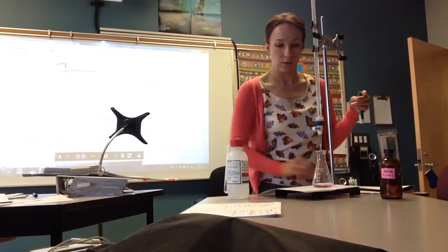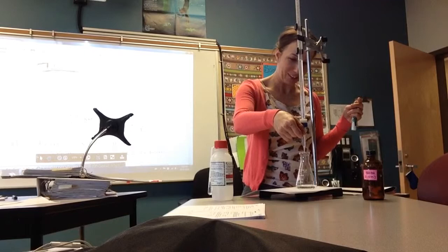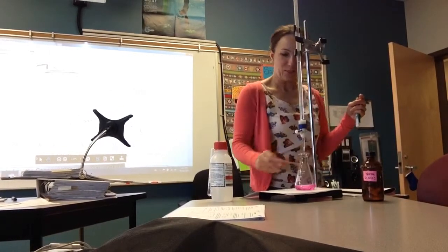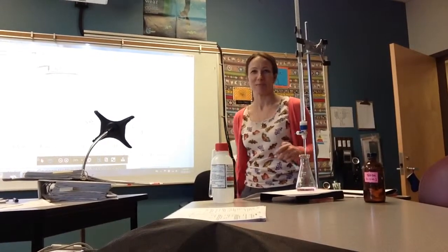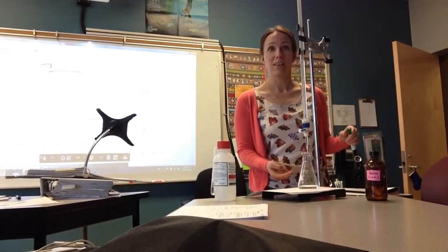And stay changed. And half a drop has to stay for about 10 seconds before you can count it changed. 4, 1,000, 5, 1,000. I think that's one of the most beautiful endpoints I've ever had. How's that for talking and doing at the same time? Oh, the braid's gone. That was 10 seconds though, don't you think?